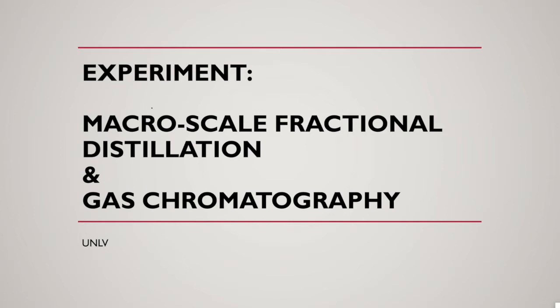Hi guys, in this video we're going to talk about macroscale fractional distillation and gas chromatography lab.